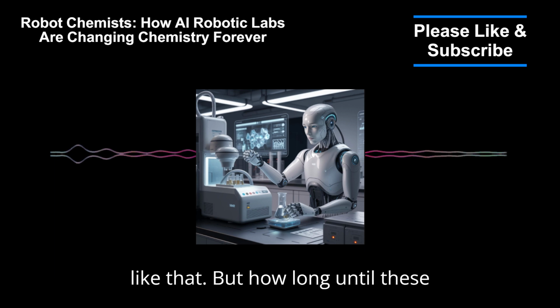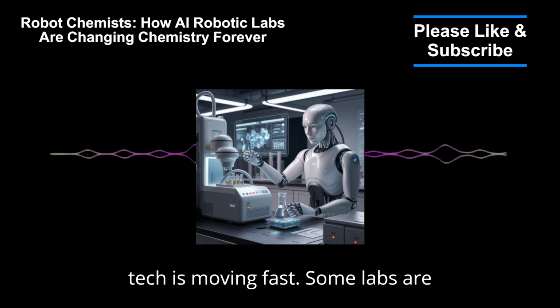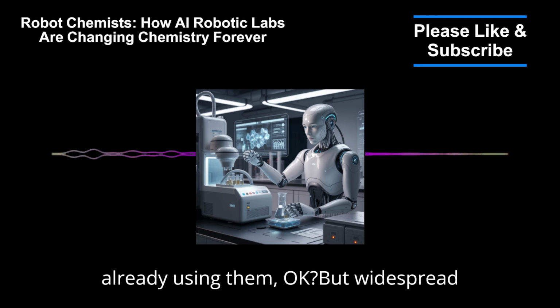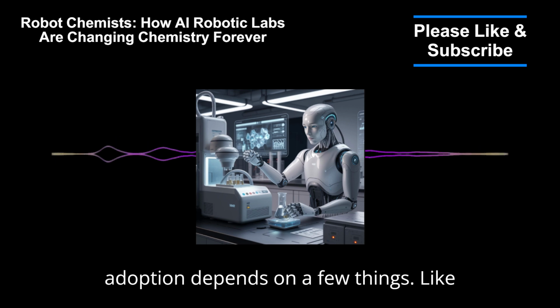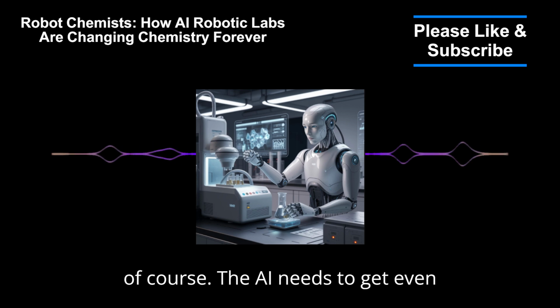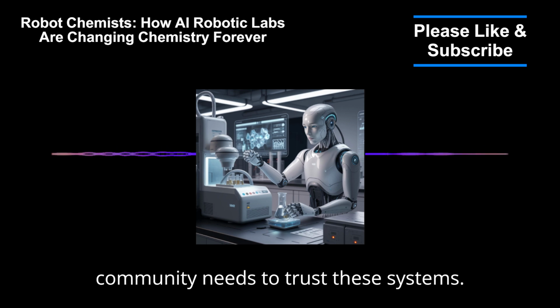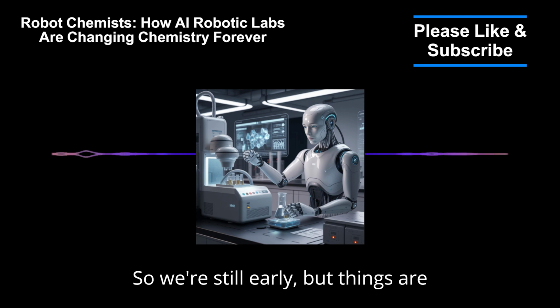I like that. But how long until these robots are everywhere in labs? Well, the tech is moving fast. Some labs are already using them. Okay. But widespread adoption depends on a few things. Like what? The cost needs to come down. Yeah, of course. The AI needs to get even better. Right. And the scientific community needs to trust these systems. So we're still early, but things are moving fast.